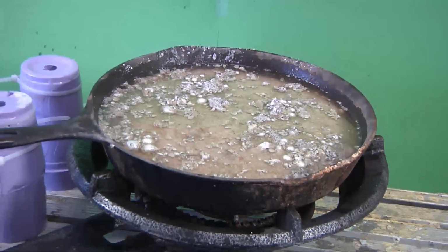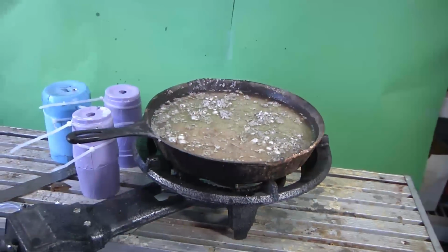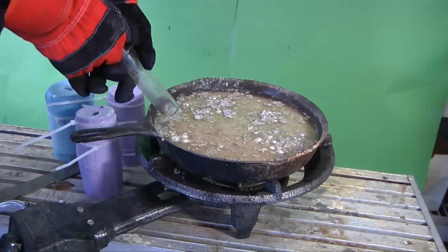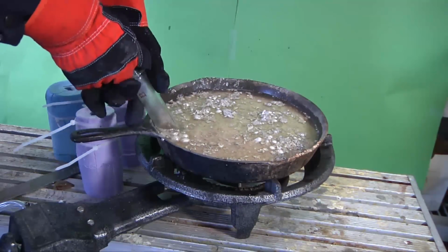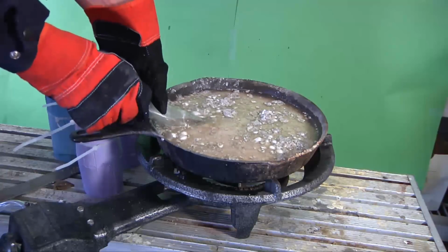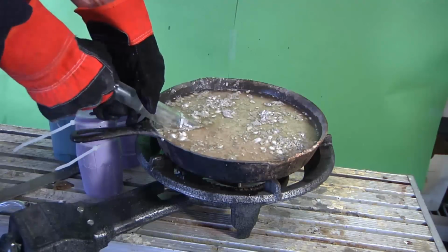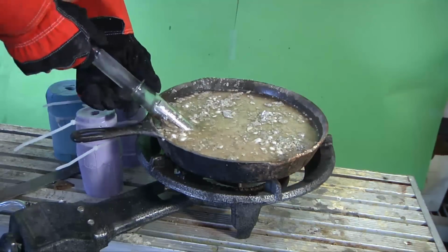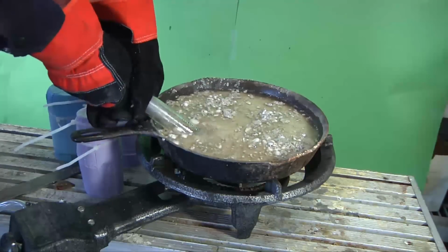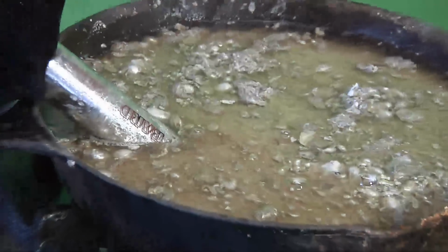So we're going to zoom out just a little bit here, and we're going to show you what we're doing. I've got a couple molds here that we made, and sodium doesn't really react to silicone rubber. And I guess first I need to tell you, it's a good idea to warm this syringe up just a little bit. You see how pretty that sodium is? I'm just going to cycle it through a couple times and let the sodium warm up the glass.